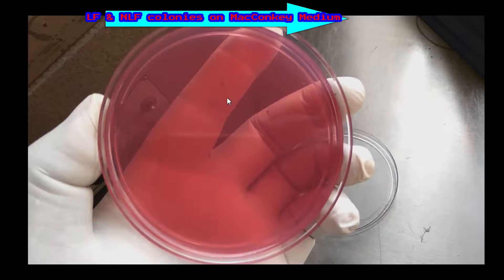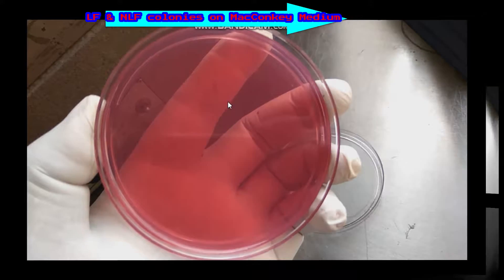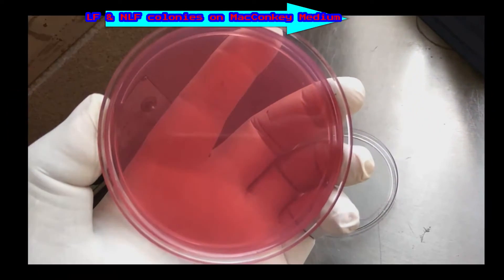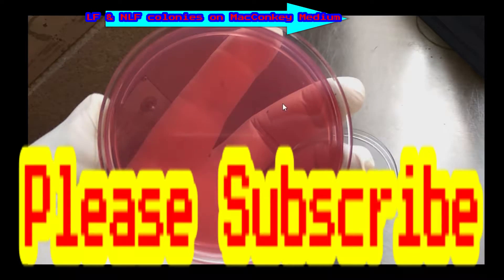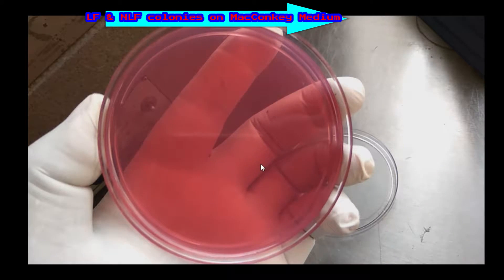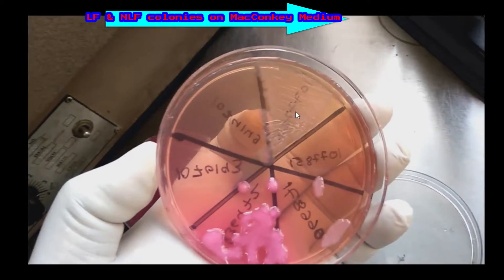Hi, today we are concerned with how to identify lactose fermenter and non-lactose fermenter colonies from MacConkey agar. So here you can see this is MacConkey agar without inoculation of specimen. Let's watch after inoculation of specimen.